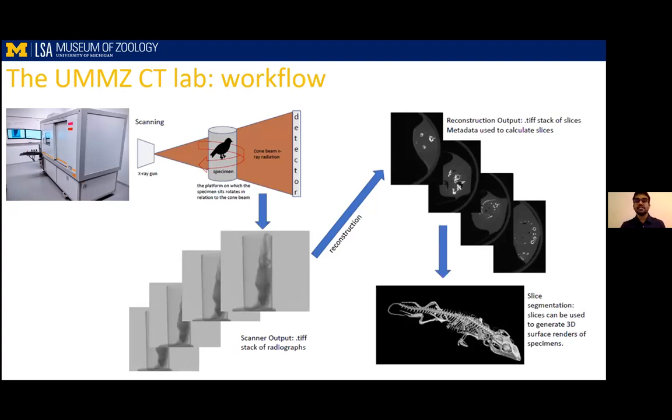So if you can see on the top right-hand corner, that series of cross-sectional images through the specimen. Again, you'll see the bone in bright white, and then the softer structures, actually in this case, it's just the bag around the specimen, shown in gray.